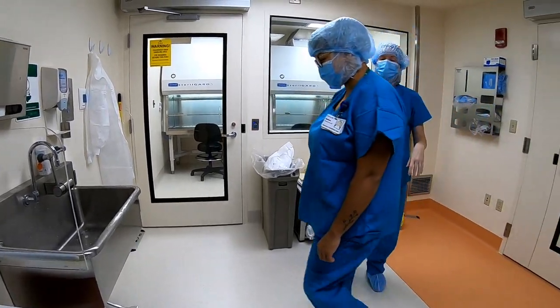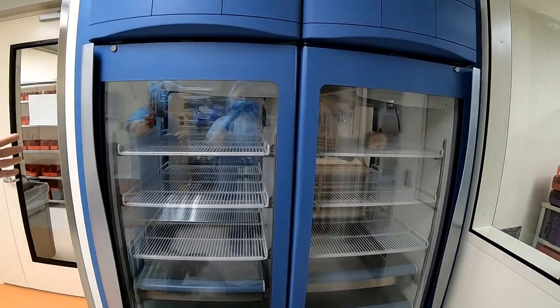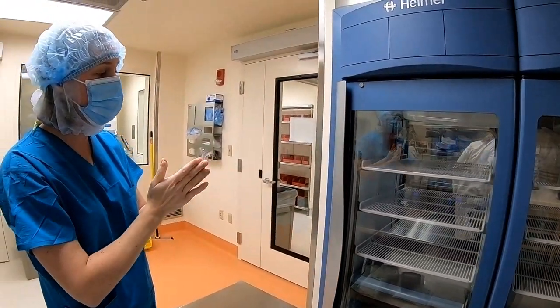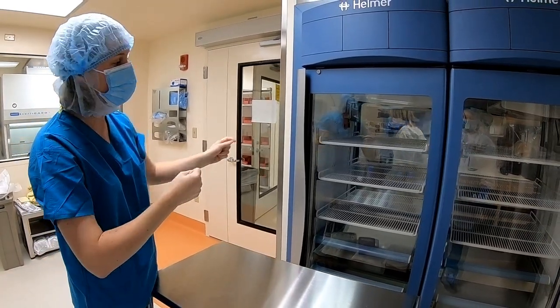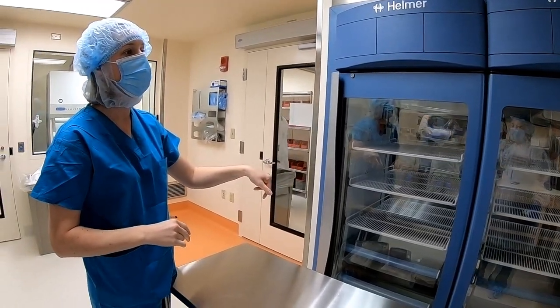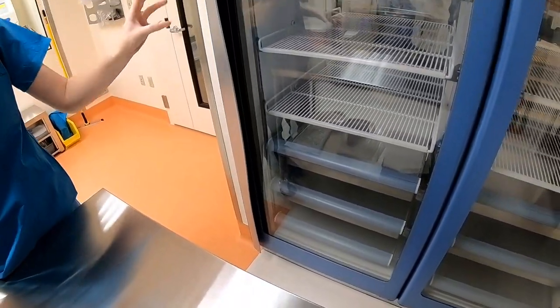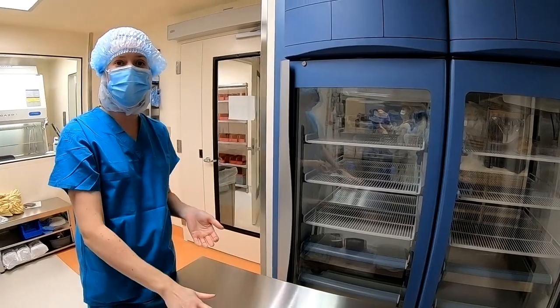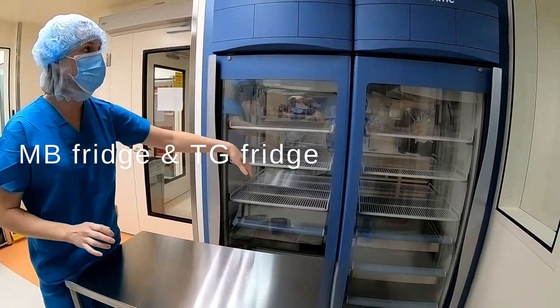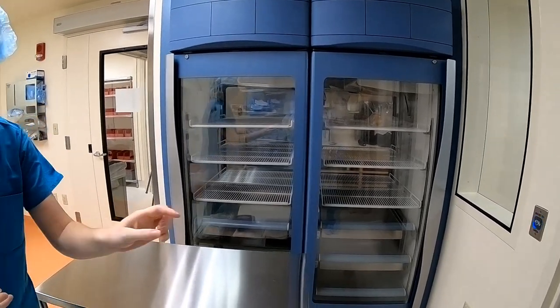While you wash, here are some other features in the room. We have our pass-through fridges — they open on both sides. You need to be aware that if you're opening the door from this side and someone has it open on the other side, the room will lose pressure. The line of demarcation is the door of the fridge, so everything you take out of the fridge needs to be wiped down immediately before you set it down. When TG is here, this will be the Mary Bridge fridge and that will be the TG fridge — a whole one dedicated to your supplies.